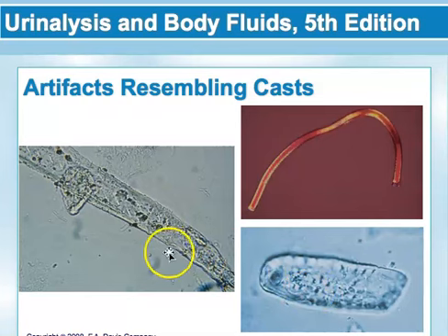artifacts. So again, you would want to just kind of focus in and out to make sure you're in the right plane. Most of these artifacts are going to be much more highly refractile than the actual elements. And then also correlation with your chemical results.